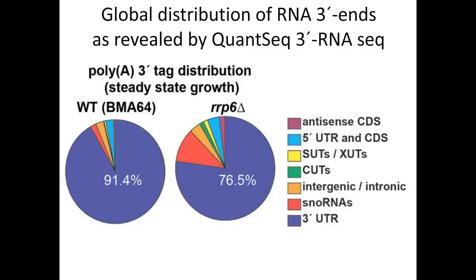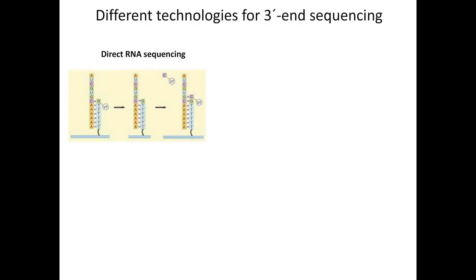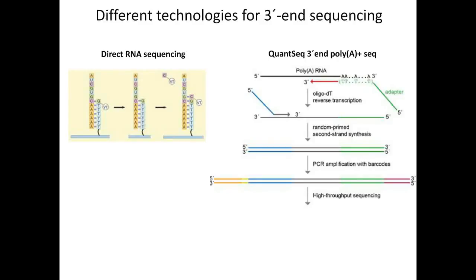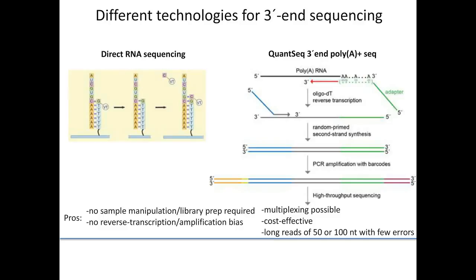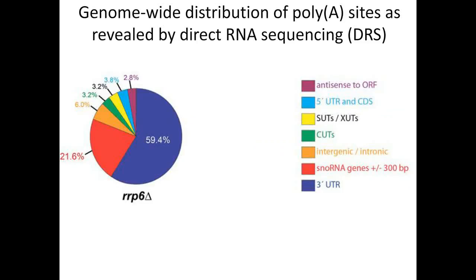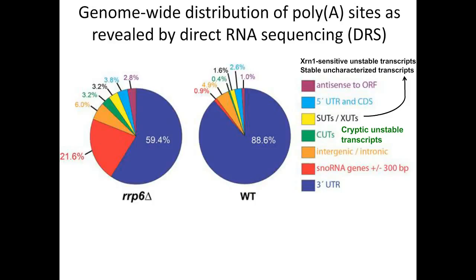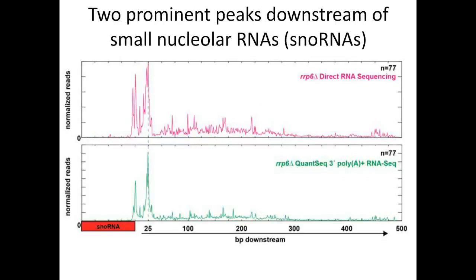And so we're not quite sure of the reason for this discrepancy in the percentages that we see in the different categories. But we think that it may have to do with the higher error rate and the shorter read length of the direct RNA sequencing, resulting in 3' UTR regions not mapping as well.